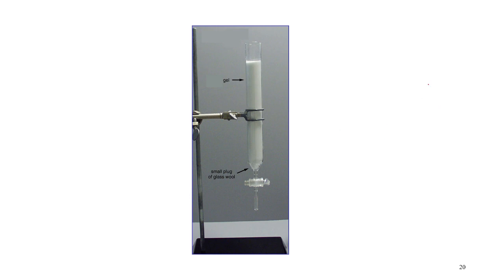You can just look at the structure of it, where this is your gel through which your protein of interest would be passing, and then you have a small plug of glass wool, and after this, when you pass your elution buffer, from here you can collect your protein of interest.